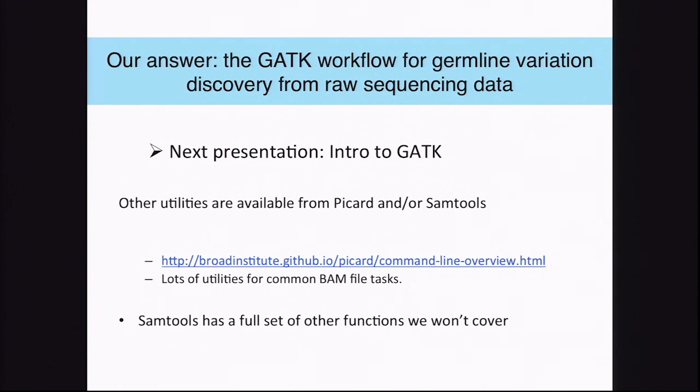Well, that's what the GATK is for. Basically, we designed this toolkit in order to solve problems like these, to make these things tractable. Hopefully, it will be useful to you.